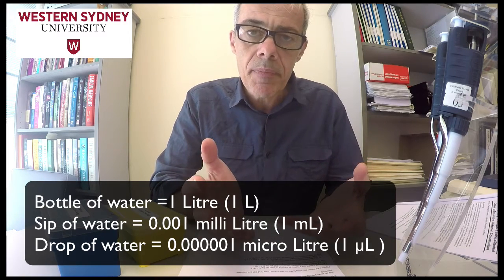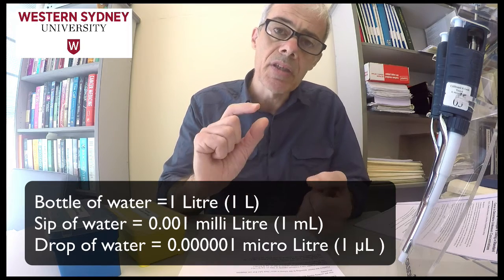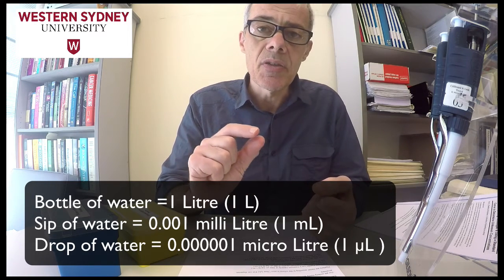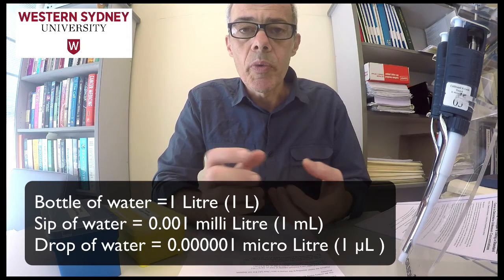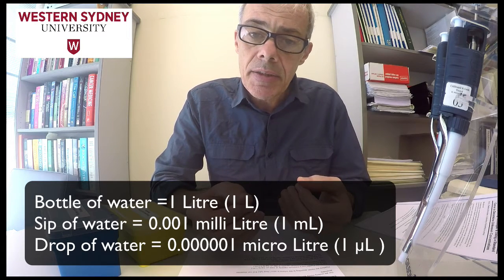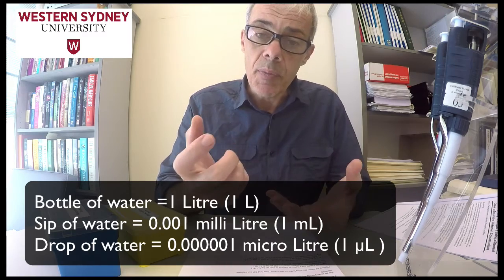We work in millilitres, which would be like a small sip from a bottle, or we talk about microlitres, which may be a drop from the bottle.